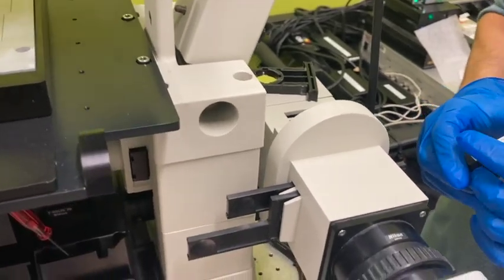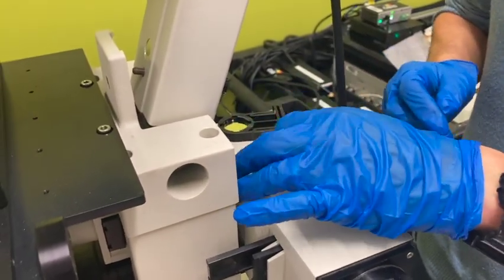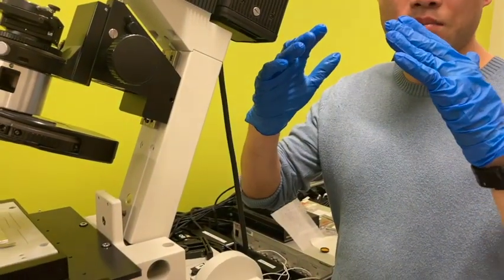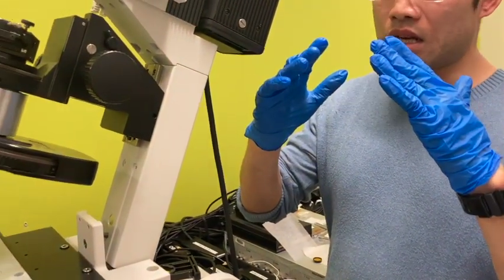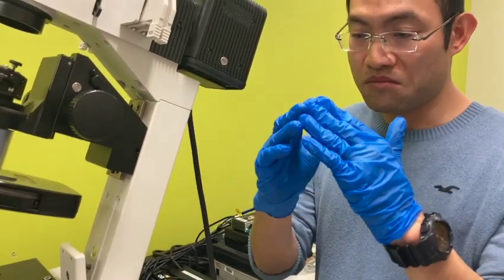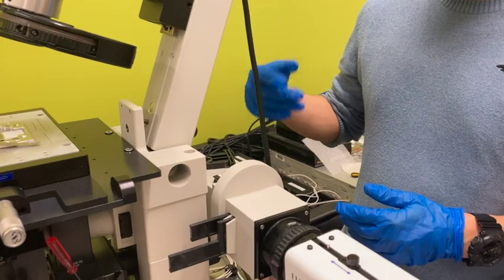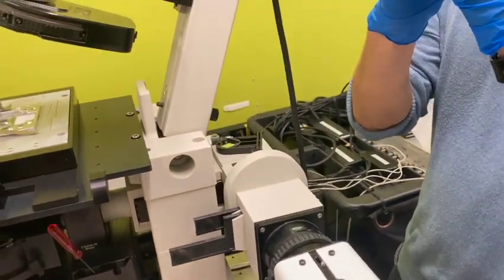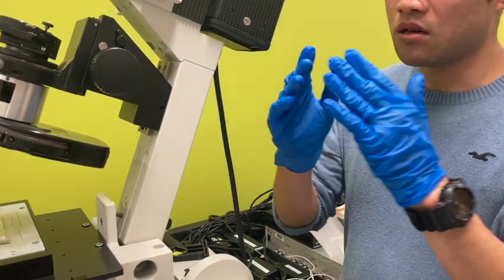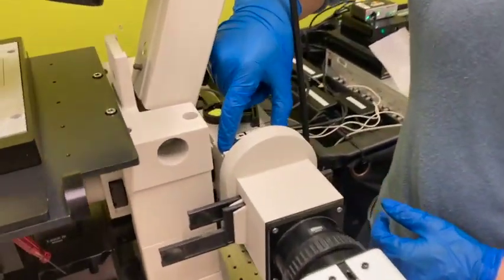The filters do what? They just dampen the signal? Yeah, it dampens a little bit, but it also narrows. This LED goes out with a kind of broad spectrum. When we say green, the center should be around 520 nanometers, but it can span out like 100 nanometers. So we need to use this filter, we call it the excitation filter, to narrow down that expansion. The narrower the expansion, the better the signal to noise, because the expansion of the wavelength is going to mess up the signal to noise. And that's why it is here.